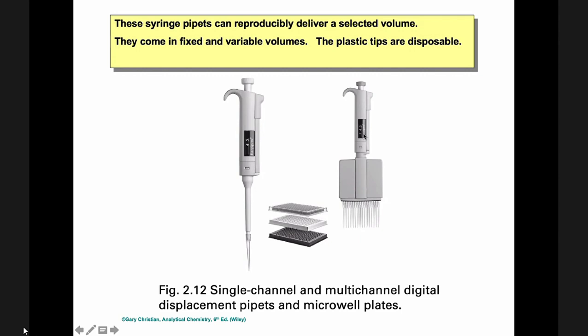So, you just set the volume. You dispense like 0.5 ml or 0.05 ml. So all of these, the 14 tips, would also aspirate, would also take in 0.05 ml. All of them, depending on the adjustment. Now, this one can do 0.45 ml because it is a 1 ml single channel pipette, adjustable. So you can adjust it 0.1, 0.2, 0.3 up to a maximum of 1 ml.